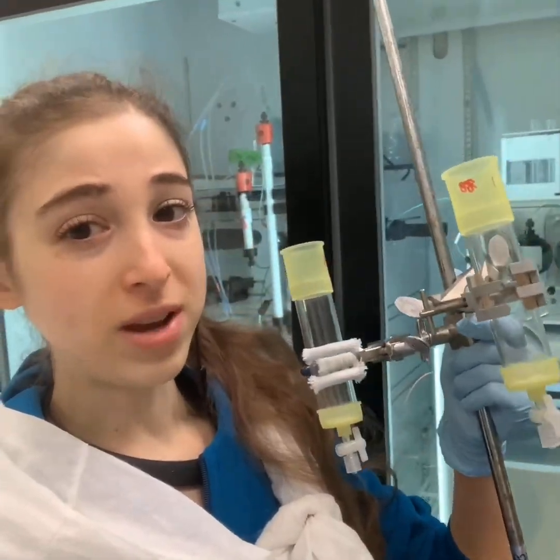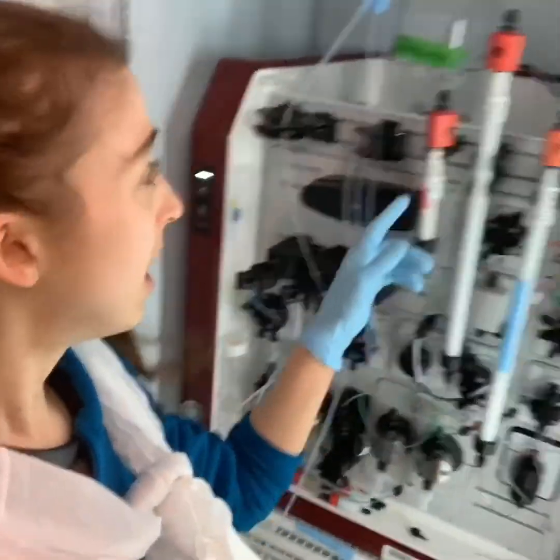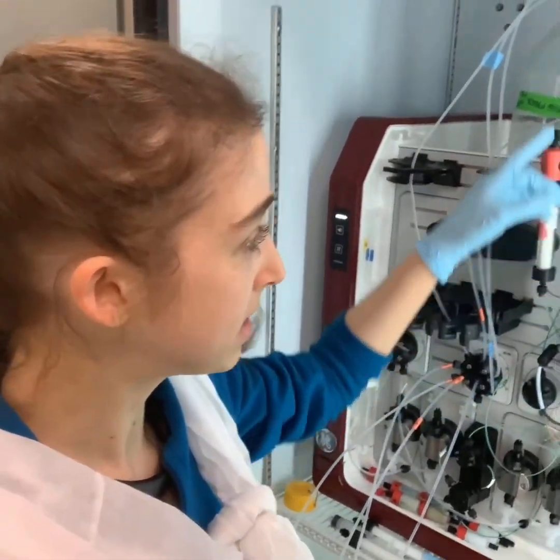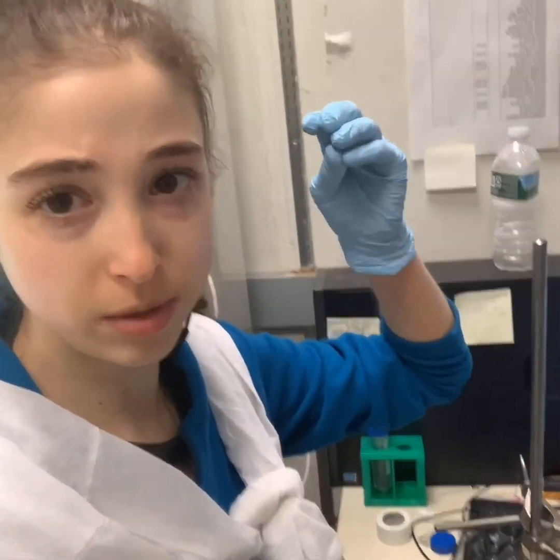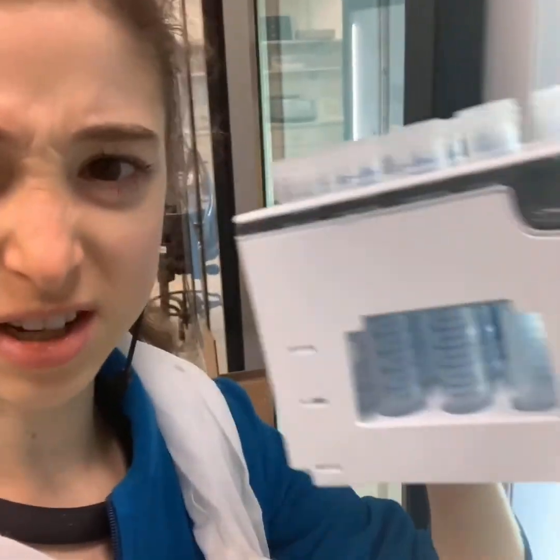Or we can do it with this FPLC machine — so this is an AKTA. Basically what it does is it has these different columns with different properties, and then all these tubes and stuff. It can flow your proteins through the columns at different flow rates and things. Then it goes through some detectors, and your proteins are going to show up as these little peaks on a graph. So there's a UV detector — proteins absorb UV light — and you'll get a peak when the protein comes off. And then you can have the machine collect the protein in different sorts of trays and blocks and different tube sizes.